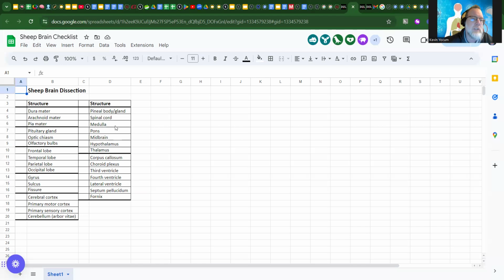We'll also notice the brain stem and the pons, medulla, and the midbrain. So basically, going up from the spinal cord, our first stop will be the medulla. And then we'll see the pons, which is kind of a P-shaped, a little pouch. Pons, I think, means pouch. So you'll notice a little pouchy outcropping of the brain stem. And then, of course, the midbrain is going to be the last section. And now we're going to be kind of inside, a little bit deeper into the brain.